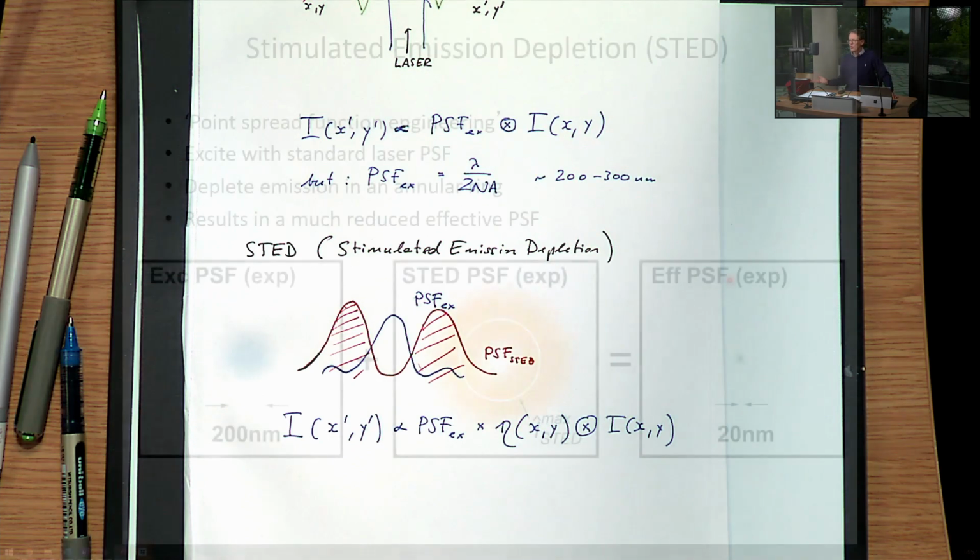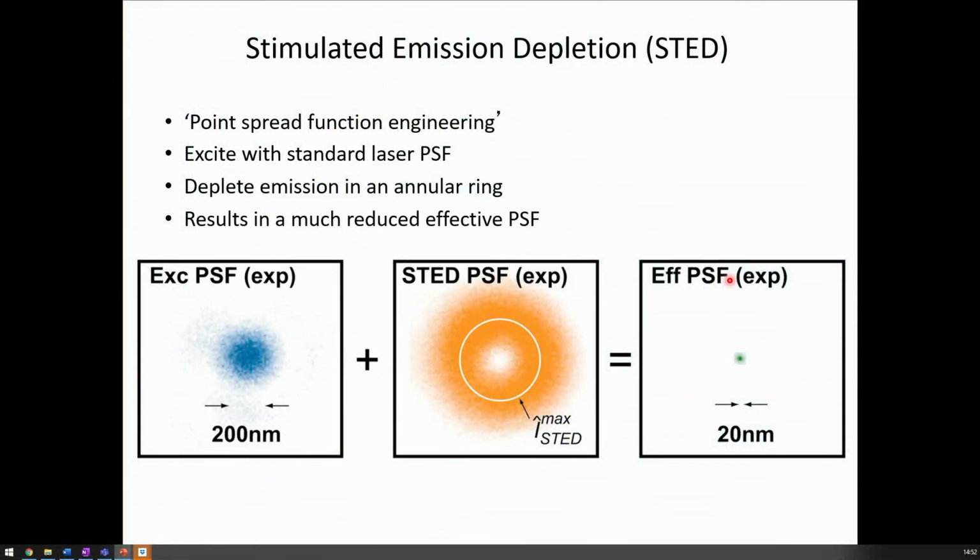And how do we switch off fluorescence? Well, in fact, you already know how to do that. If you remember, in our discussion on fluorescence, we have different rates. We have a rate going up, we have a rate going down because of stimulated emission. And of course, we have a fluorescence rate going down plus the quenching rate. And one way of preventing the A21 from dominating is by switching on B21 and making it very, very strong.